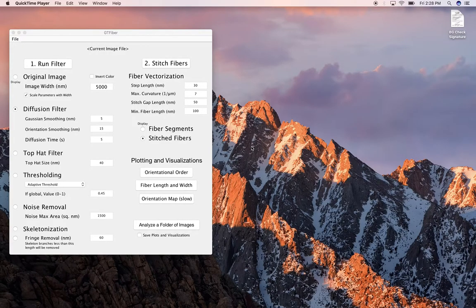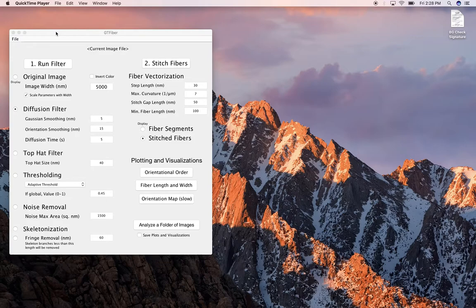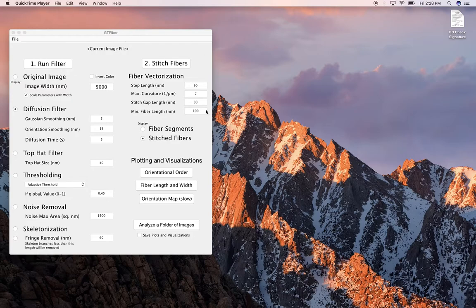This video is a tutorial on how to use the GT Fiber software. To install the software I made a different video, but if you've already gotten this far, I think that means that worked. So we have gone into our applications, and again this is on a Mac OS operating system, but the actual inner workings of the software are the same on Windows.